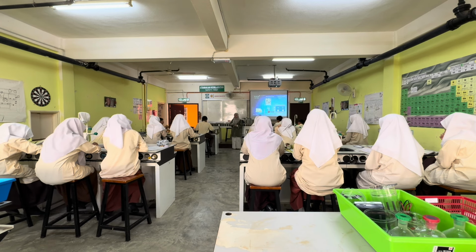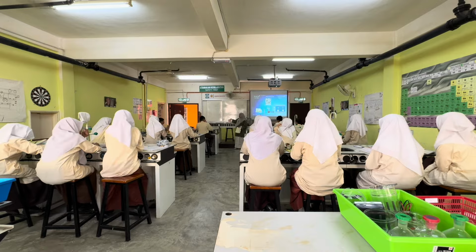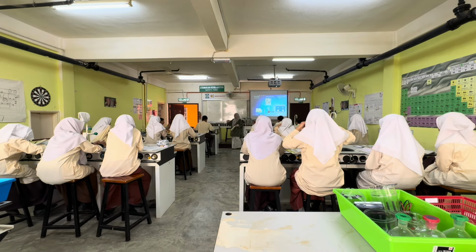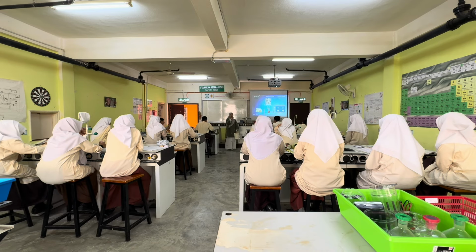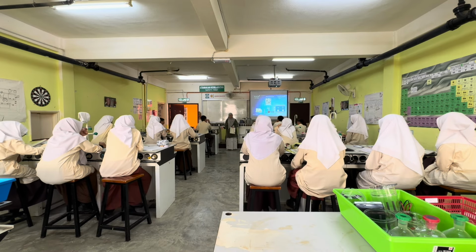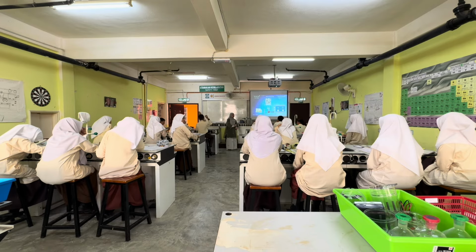So the rates of stirring, which one do you want to use? This one or this one? Fine. Okay, use this one. Fine. One spatula. The one you have 2 students here, kan? Dalam one bench, one group, you have 3 to 4 students. So one stirs very fast, and lagi satu stir slower.